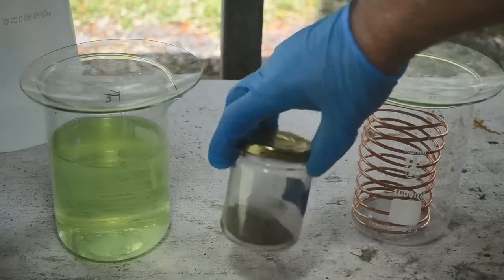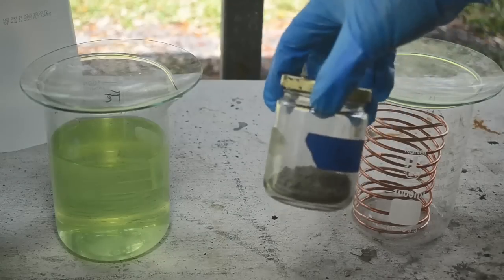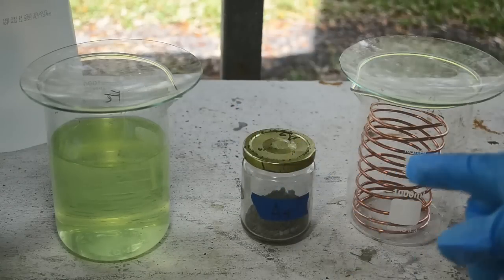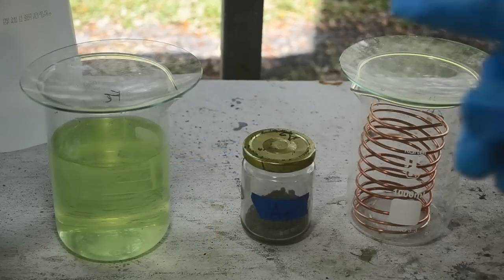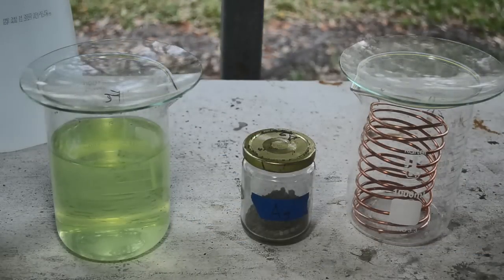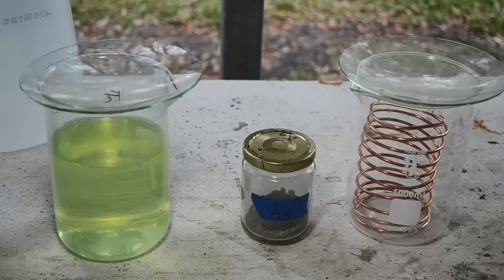Here's a jar of silver powder. Most of this is from cementation on copper, okay? And I took some of this and I redissolved it into nitric acid, and I got this over here. So this is clearly contaminated with something, because pure silver nitrate solution should be clear. I'm thinking that's pretty much copper in there, giving it that greenish tint.